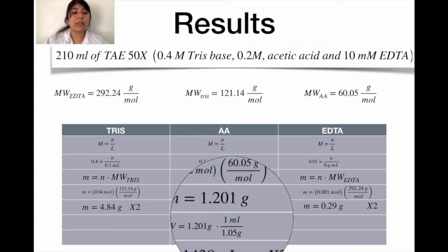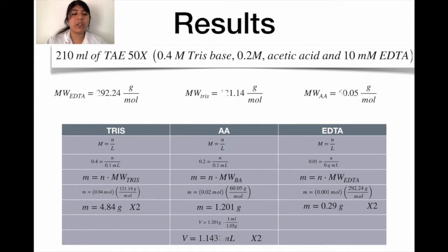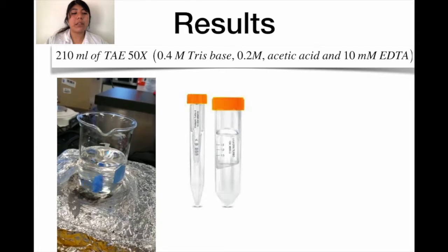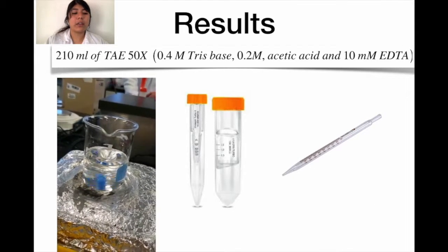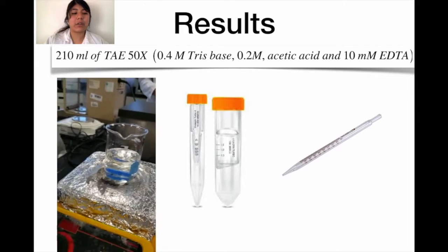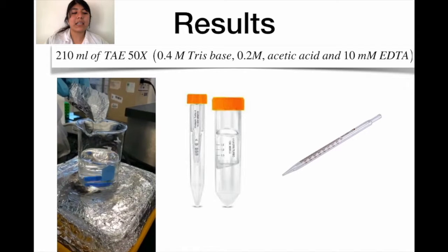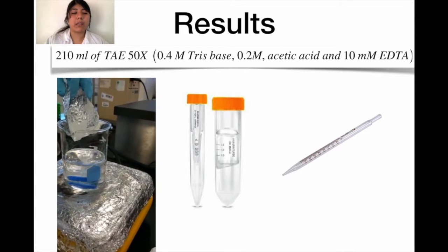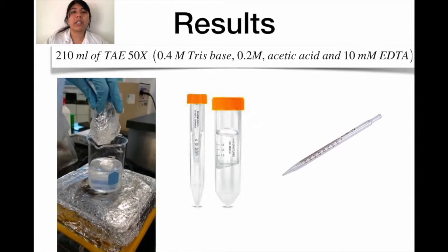Each value of grams and volume is added twice. For the preparation of the solution, in 120 ml of water, grams of Tris are added to be dissolved on the hot plate with magnetic stirrer. Then, grams of EDTA are added, and finally acetic acid is added with a graduated pipette. The solution is gauged and put in a container for sterilization.